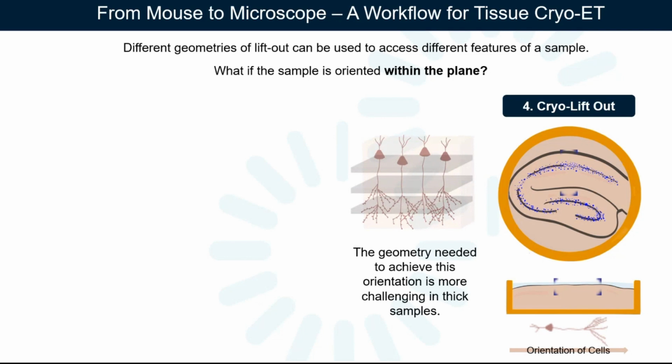So if you imagine you take your cells like this, and then eventually make your sections like this. So it involves a 90 degrees rotation, but you can't actually do that with the hardware. So you've got to basically lift it out a certain way, which I'll try and explain now. But here is how schematically that looks, where you'll have the layers of tissue going this way, and then you take your serial sections, which are the gray blocks. So you get a different perspective of the tissue organization.